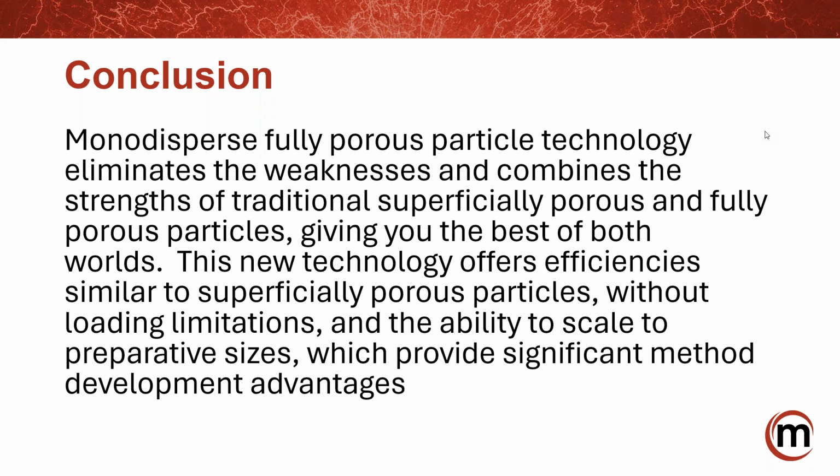Another question. How are the pH and temperature limitations for these particles compared to other fully porous and superficially porous particles?